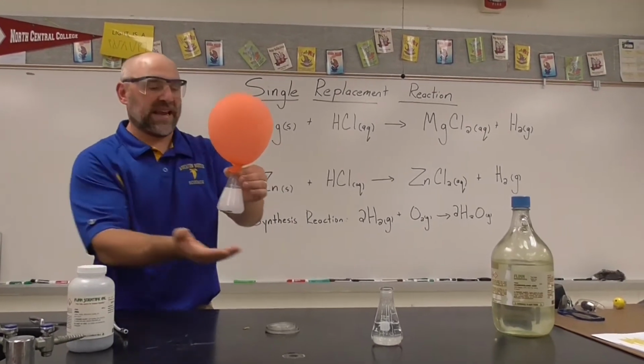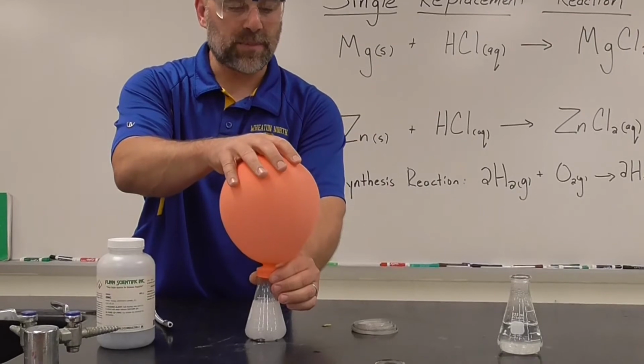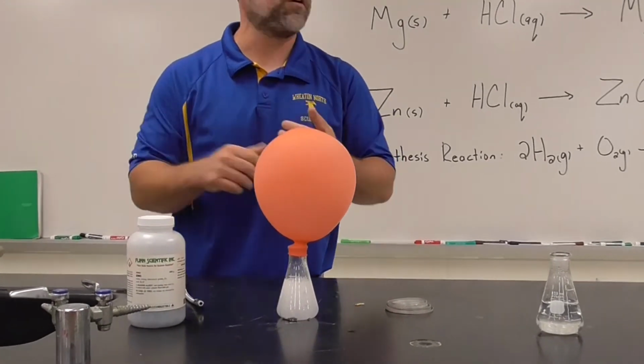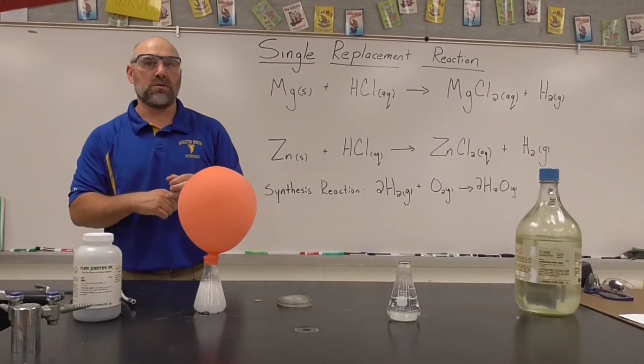Why am I showing you the same reaction essentially twice? I'm showing it to you because I wanted to trap these bubbles and show you a secondary reaction, a repeat of one you've seen earlier, which is a synthesis reaction, but I'm going to have to take you over to the fume hood to show you that.